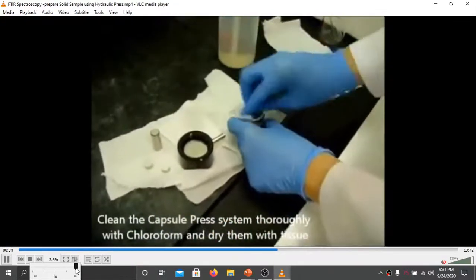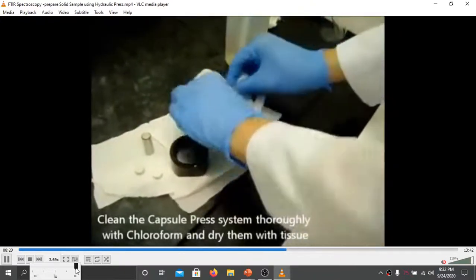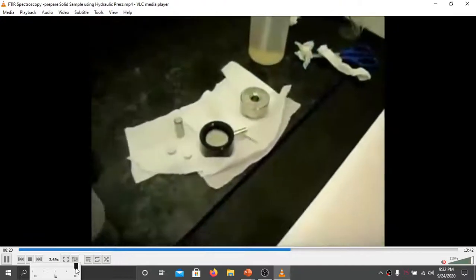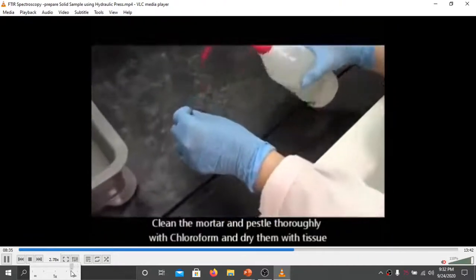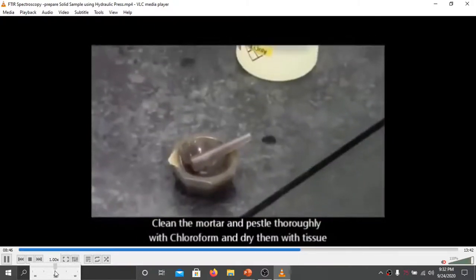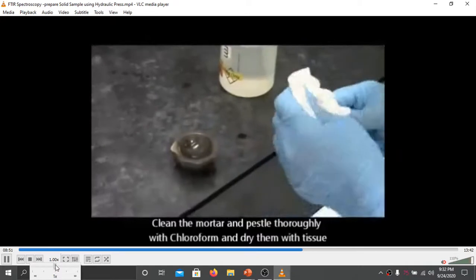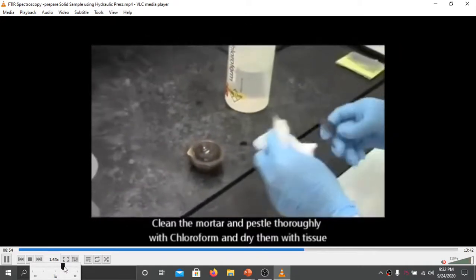Here the dies, punches, and everything are to be cleaned thoroughly before further use. Now again the mortar and pestle is taken. It is again cleaned thoroughly. Now for preparation of your sample, this dried mortar and pestle will be used.